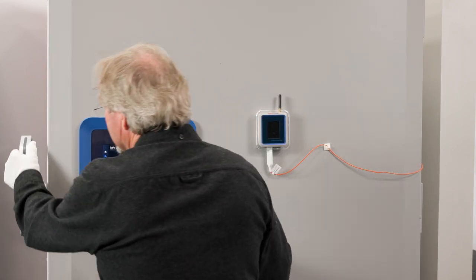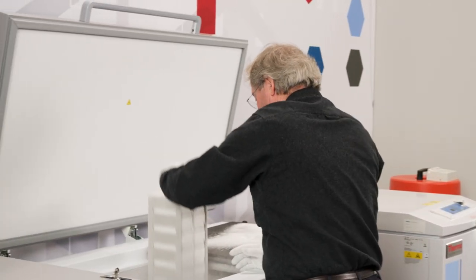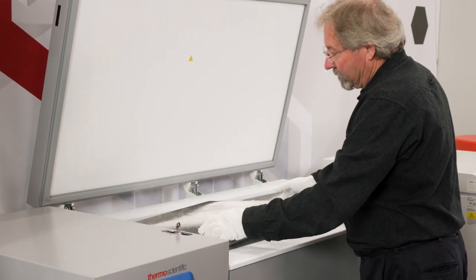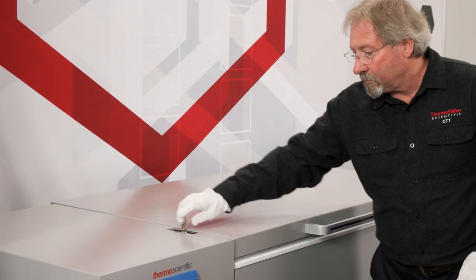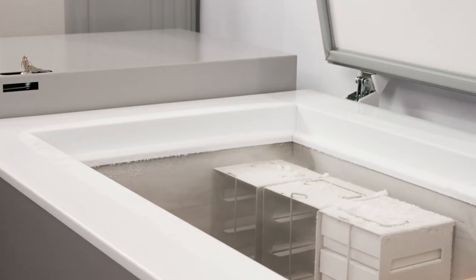Here is an example of a chest freezer model. Chest freezers can store large amounts of small samples and be used for bulk and irregular storage configurations. They also provide flexibility, letting you create your own storage solutions for hanging bags, oddly shaped containers, and applicators.